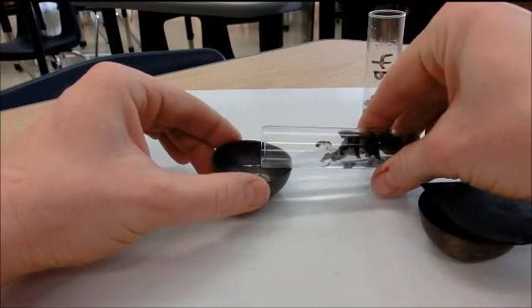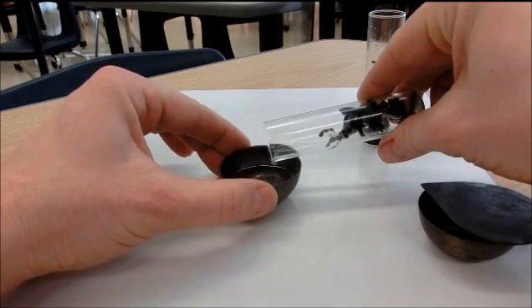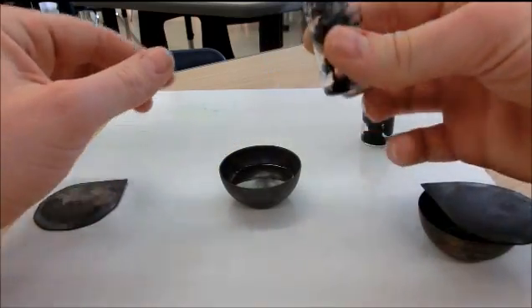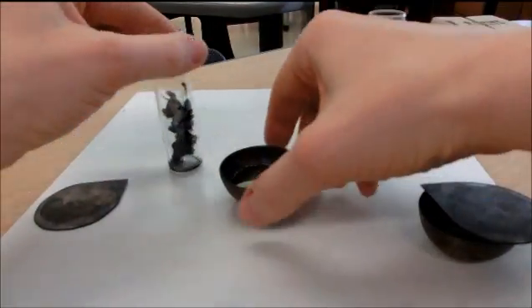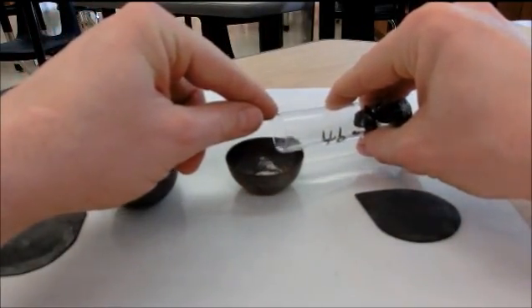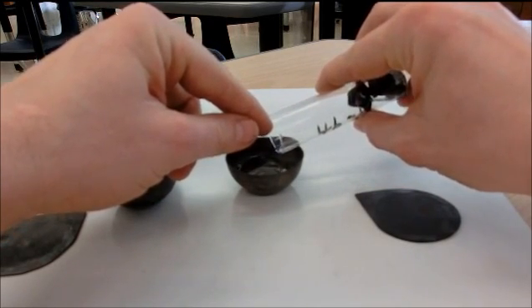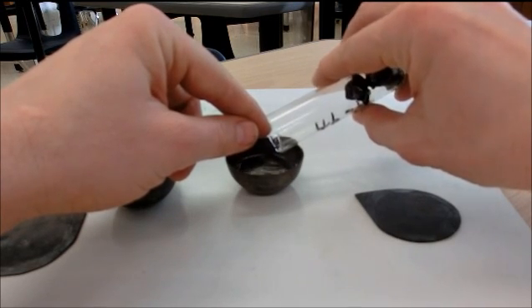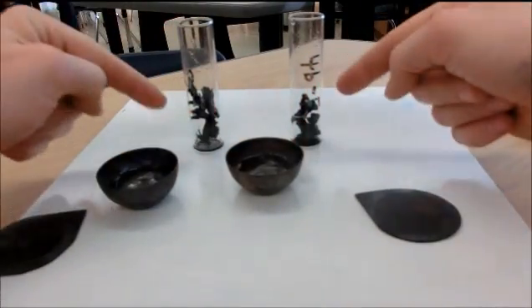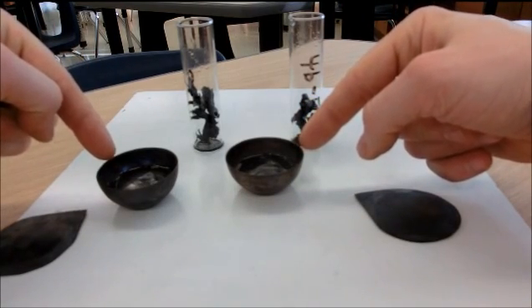I am going to carefully pour out just the liquid portion, and then we are going to rinse this with a little bit of water. Same thing over here — carefully pouring out just the liquid portion. Then I am going to add some water to both of these, rinse them slightly, put them into their respective containers, and heat them up to boil off the water.